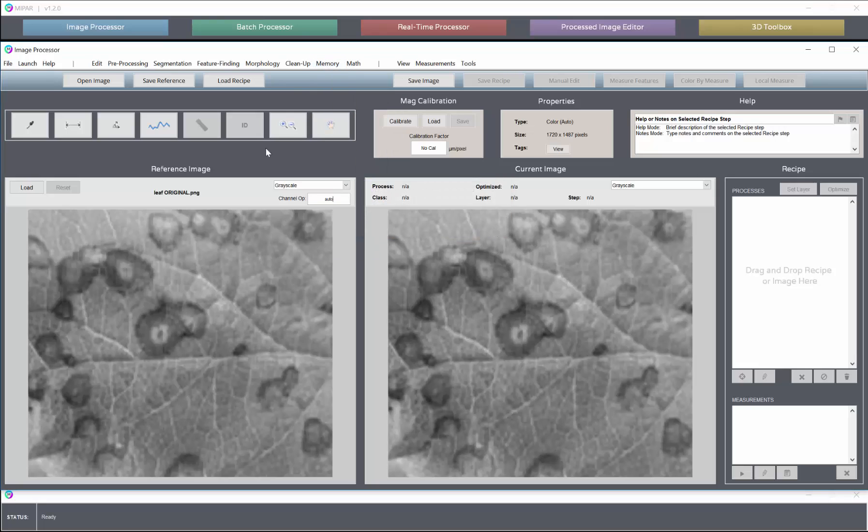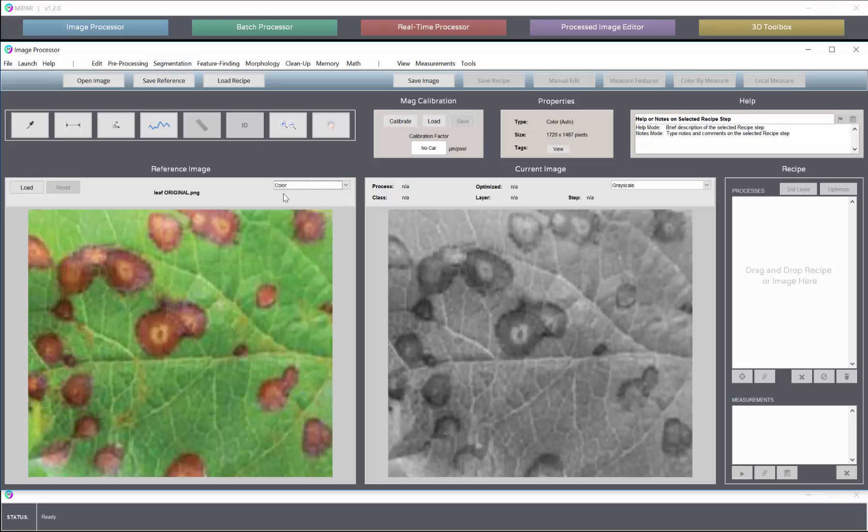So the color cluster is really more of a memory option than a segmentation. It is a segmentation, but it's always drawing from the original image so that it draws from the color content.